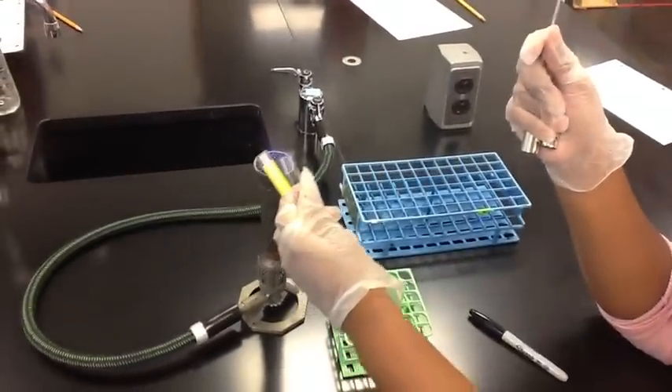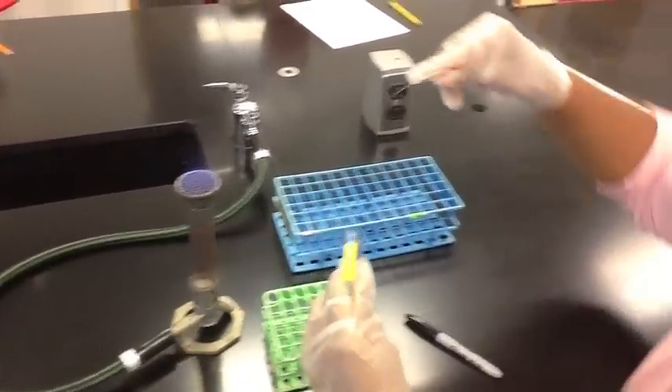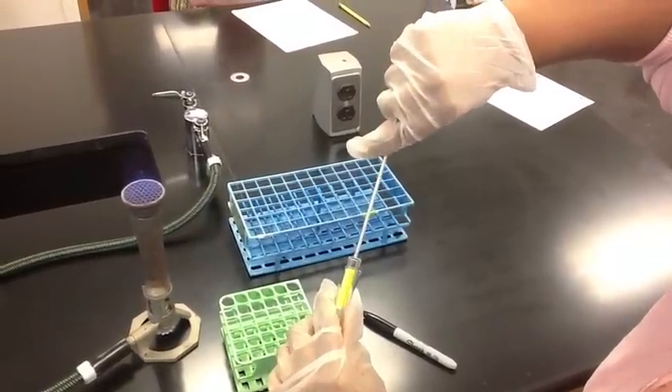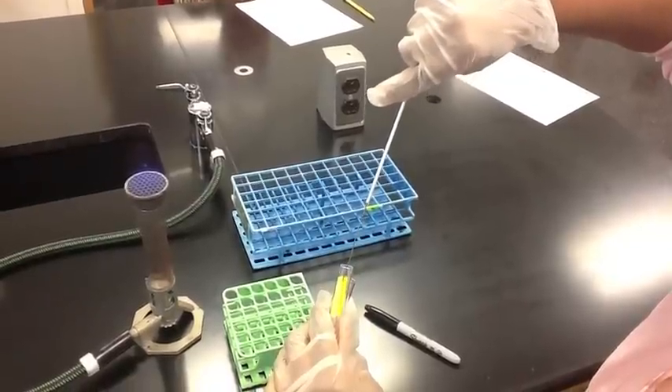Next, you should flame the openings of both of the tubes. Proceed to insert the cool sterile inoculating loop into the tube with the culture and pick up a small inoculum of bacteria. You will inoculate the fresh tube of broth as shown in the video.